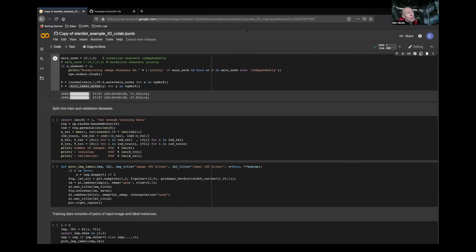Do you need to make a max projection between the 4 channels, or what is it that you... So if you give 3 or 4 channels as an input, it will use them independently and it will normalize them independently. So it will use all the information in all channels, but without projecting them. If you want to exclude certain channels and say, don't look at this channel, then just don't provide that channel, right? So by default, it will use everything that you give it, and it will actually learn how to mix them properly, such that the final segmentation is the best, right?